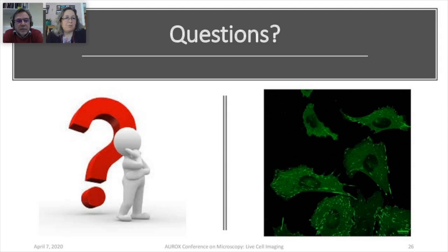So I've always been a big proponent of wide field, and as I mentioned at the beginning, I think it's really underused. I think it's a great tool for a lot of biological questions, of course knowing the limitations of sectioning and sample thickness. So as a general rule, I think wide field based techniques, spinning disk, and light sheet is another one, where it's a more distributed light and a camera based technique, are good for live cell imaging. I think laser scanning and STED and all these things can be optimized, but we need to do the experiments to find the best regime to minimize toxicity.